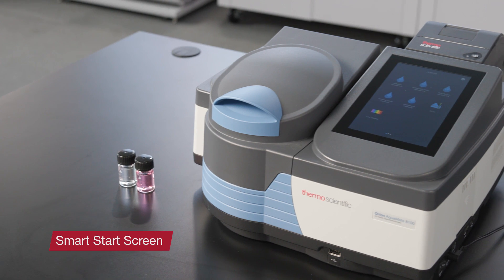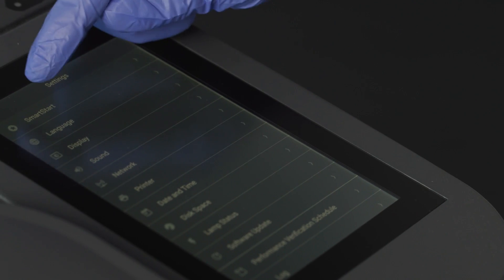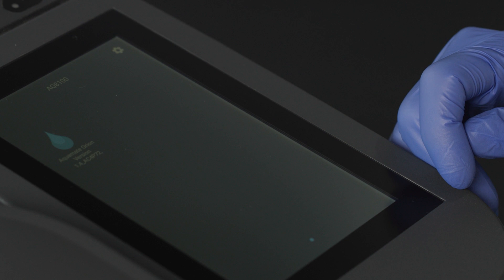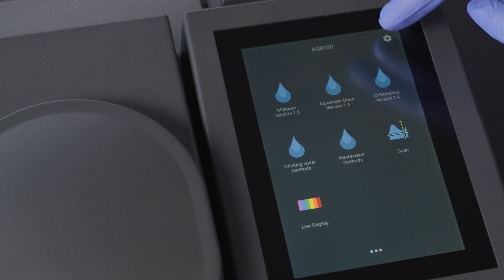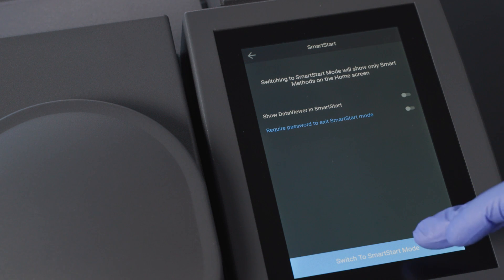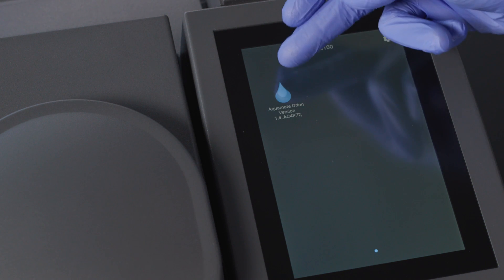There's also a Smart Start screen. This allows us to store frequently used methods in a special folder. So, for example, if I know that I'm going to do a chlorine test every day, I can store the appropriate method in this folder. To access the Smart Start feature, I simply go back to the settings menu, then select Smart Start. This could be password protected if we want to limit access to just the selected methods.